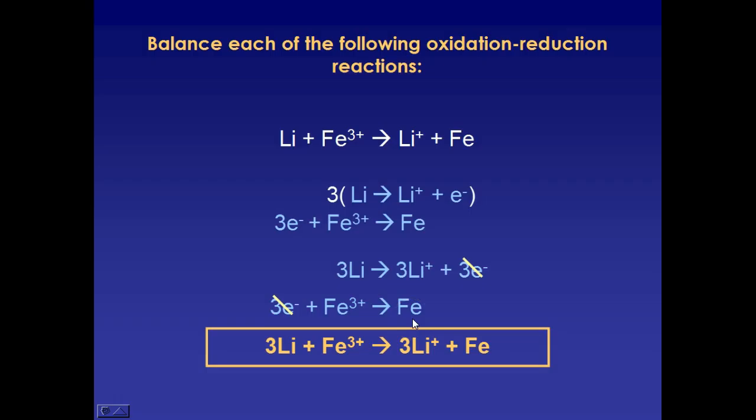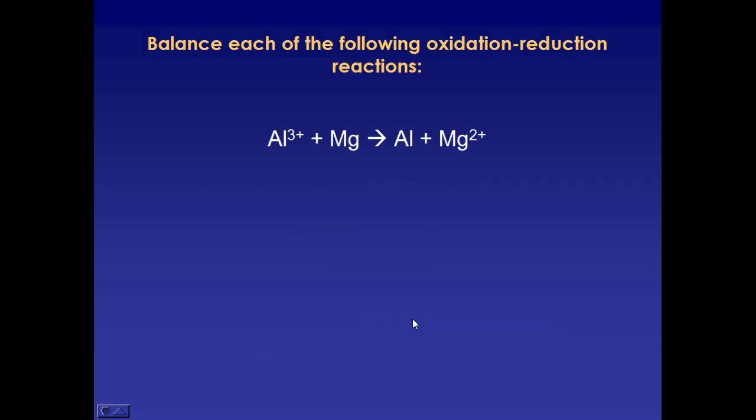It was undergoing reduction. I think this may have been one of the reactions you chose to do in the second part of part 1, between aluminum and magnesium. No, actually, I don't think y'all had aluminum, so I don't think you got to do this one either. Sorry. We would split this one in half again between aluminum ions and aluminum, and magnesium ions. This time we see that aluminum is gaining 3 electrons, while magnesium is losing 2 electrons.